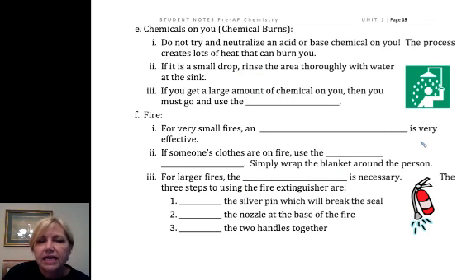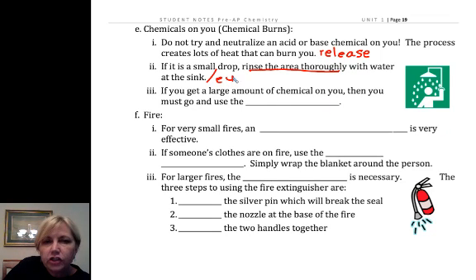Chemical burns: if you get chemicals on you and it's irritating or burning you, you need to let me know. We don't neutralize, because neutralization reactions release heat, and that can cause a heat burn in addition to the chemical burn. So you don't want to try to neutralize it. The key thing is to rinse the area thoroughly with water in the sink, or you can use the eyewash for that. And if it's a substantial amount, you will go into the shower.